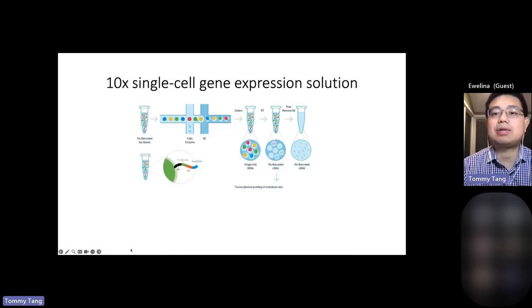So now let's dive into our topic today: single cell analysis. For today's talk, I will focus on single cell RNA-seq. There's a booming spatial transcriptome field, which is advancing really fast, but I will not touch it today. There are many single cell platforms, and one of the most popular and familiar ones is the droplet-based technology, which is commercially available from 10x Genomics.